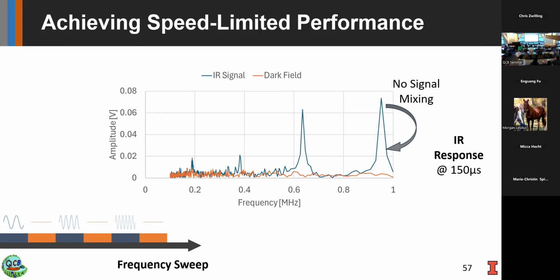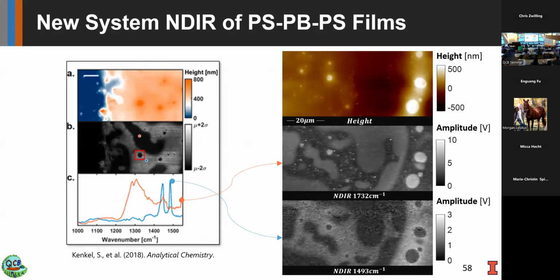This is taken with the QCL, the IR laser, on a film. You can see that if we delay the pixels by 150 microseconds, this goes away completely and we get independent measurements at each pixel. So right now, this is maybe an interesting direction to understand how to improve this speed, but that's the rate at which we're going. And this is just the last slide.